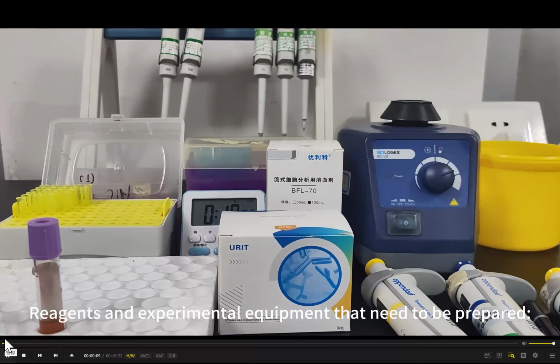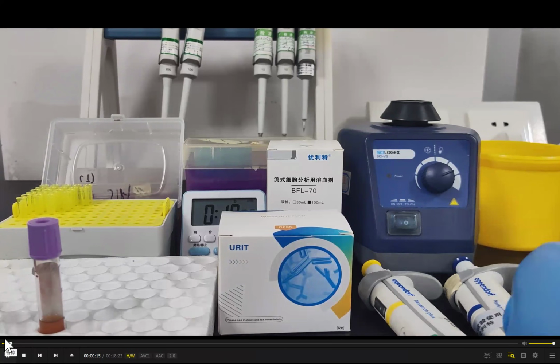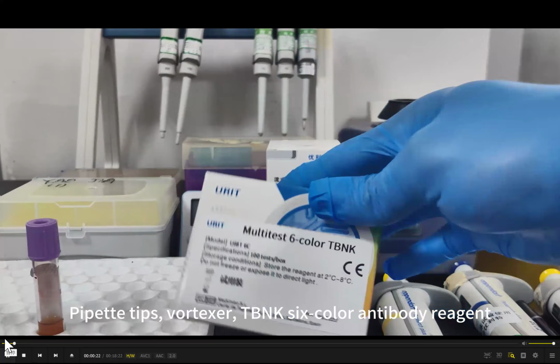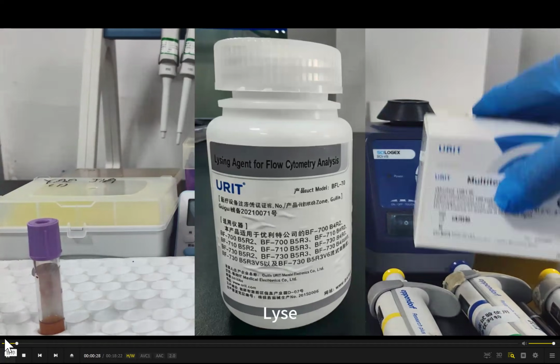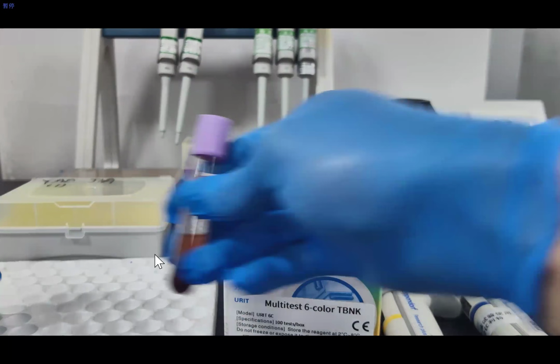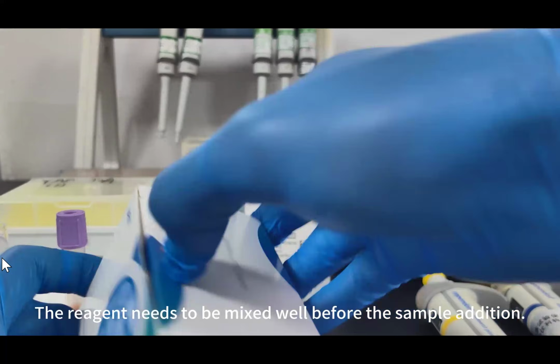Reagents and experimental equipment that need to be prepared: pipette, pipette tips, vortexer, TBNK 6-color antibody reagent, lysis solution, flow tubes and fresh blood samples. The blood sample should be EDTA anticoagulated. The reagent needs to be mixed well before the sample addition.